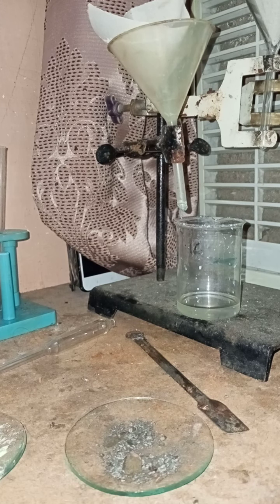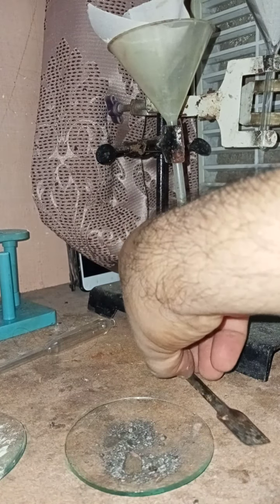Now I am going to add hydrochloric acid, or acid solution, to both these substances. One is a compound, another is a mixture, and let us observe what happens. So I have two test tubes. In both these test tubes I am going to add the substances.